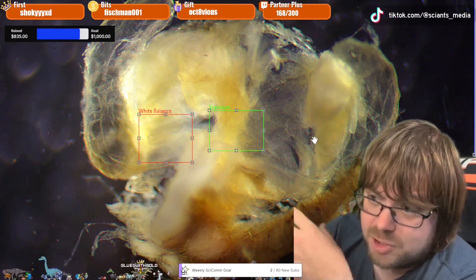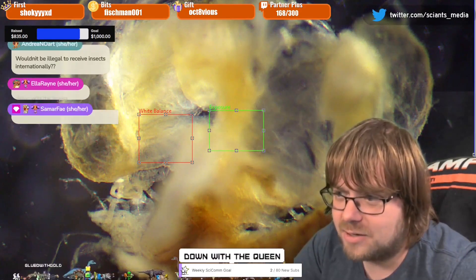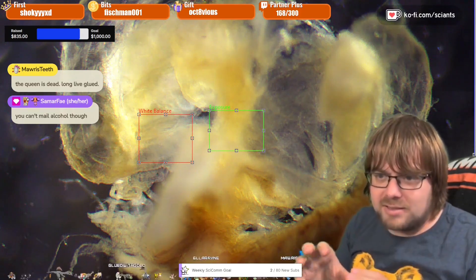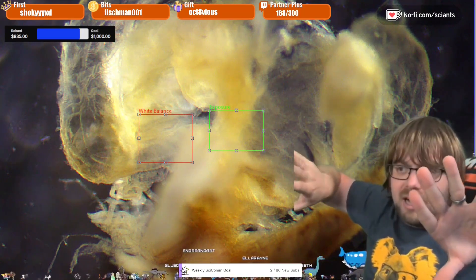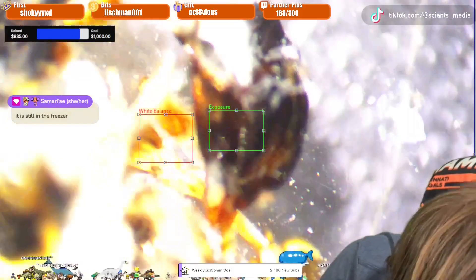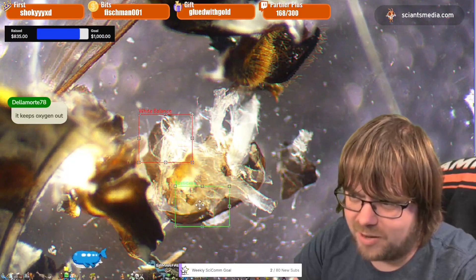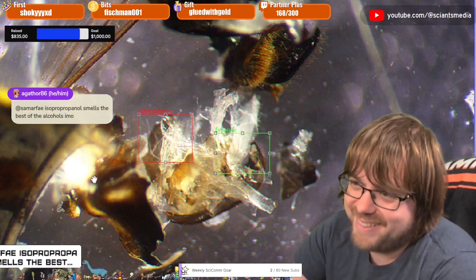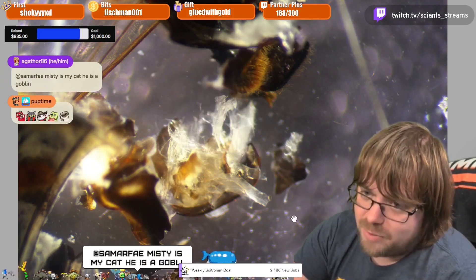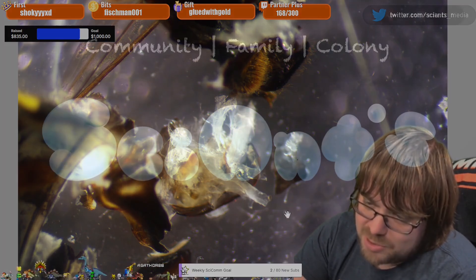This one's ovaries are a little wrecked just because she was caught as an aged animal, but you see this white mass here and this white mass there - those are embryos. Just like the brain is a mirror image, there is one mature embryo on either side of this organism. And this here is actually the venom gland - I unfortunately ripped part of it, but right there is where the stinger connects. The venom gland shuttles venom down tubes to the stinger.